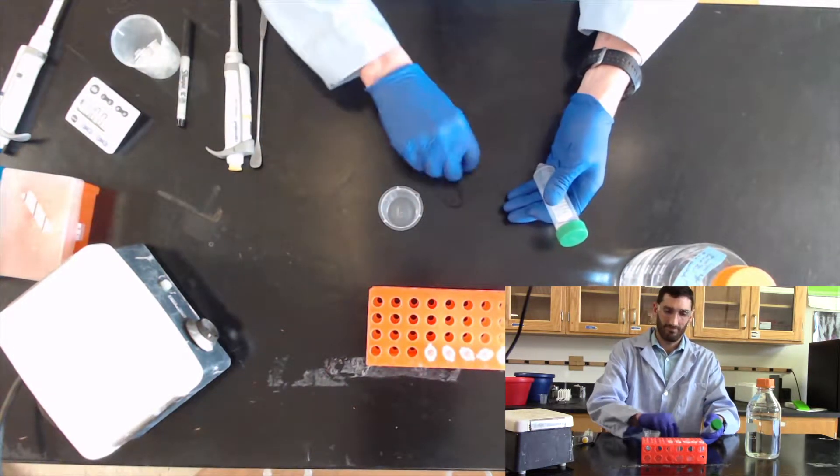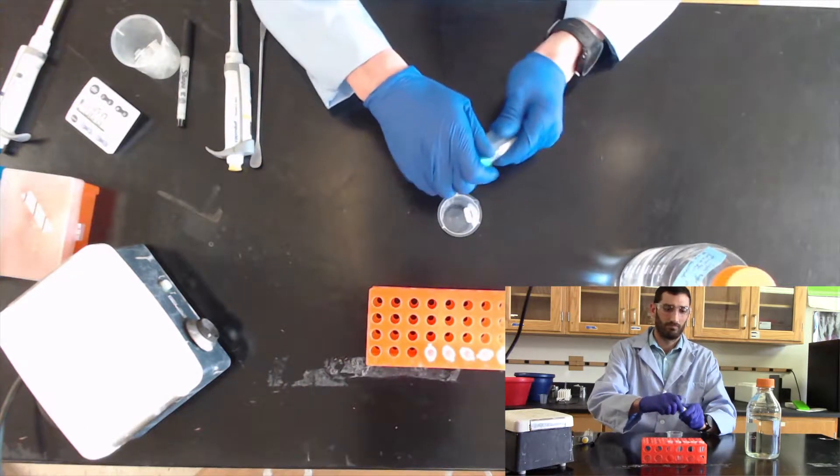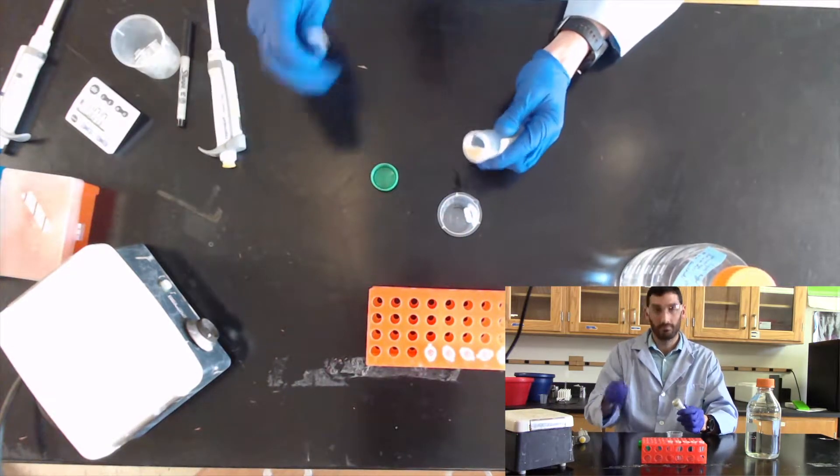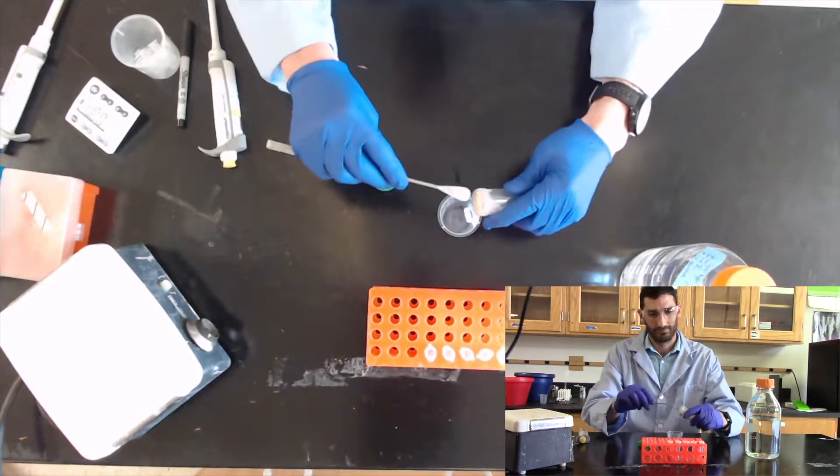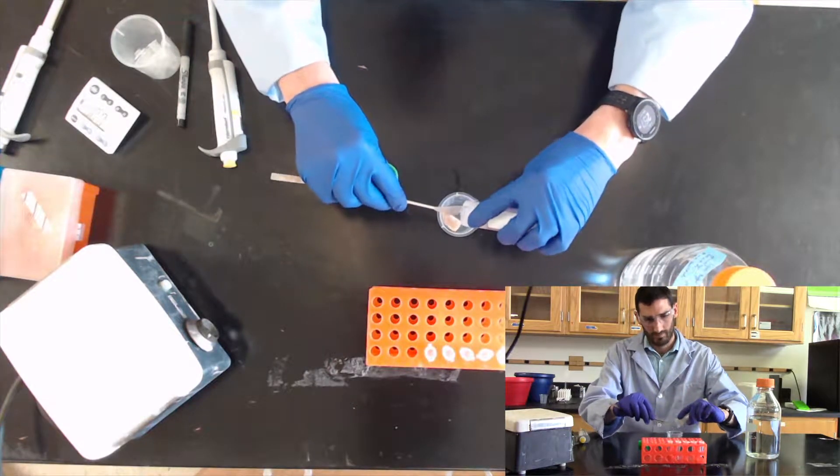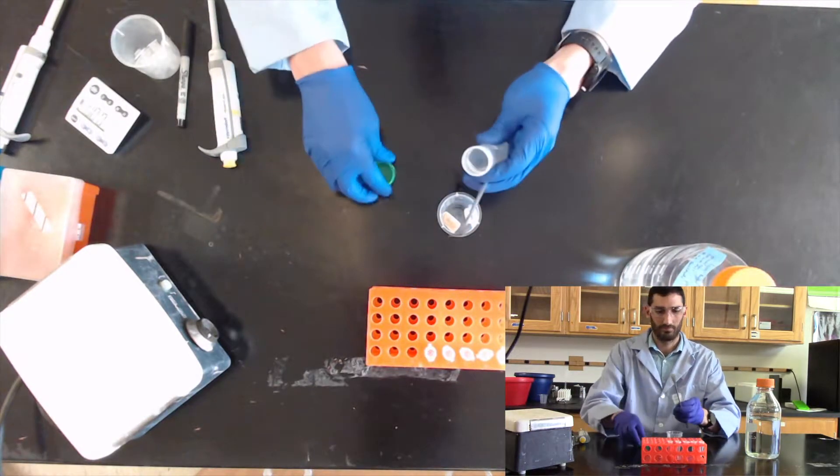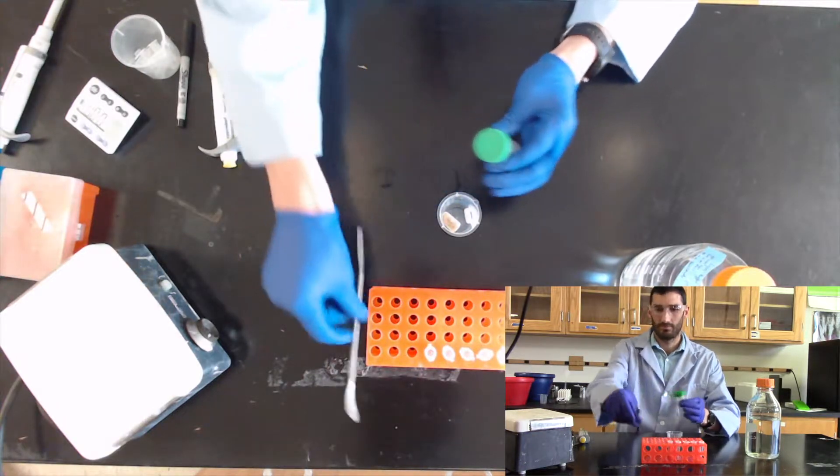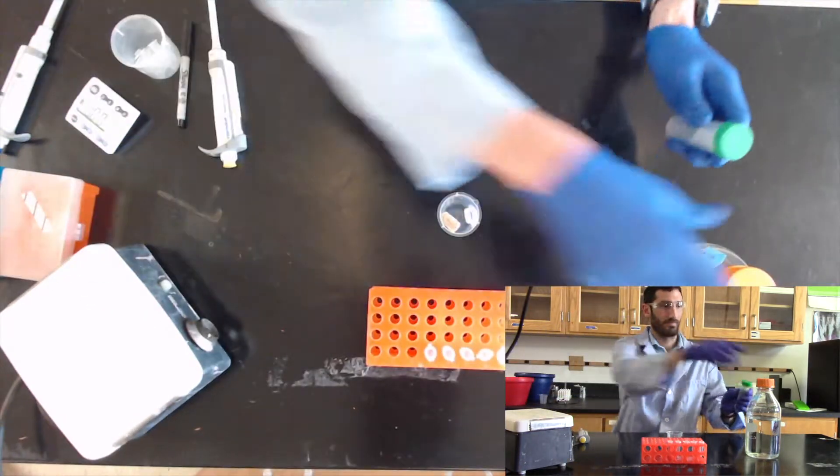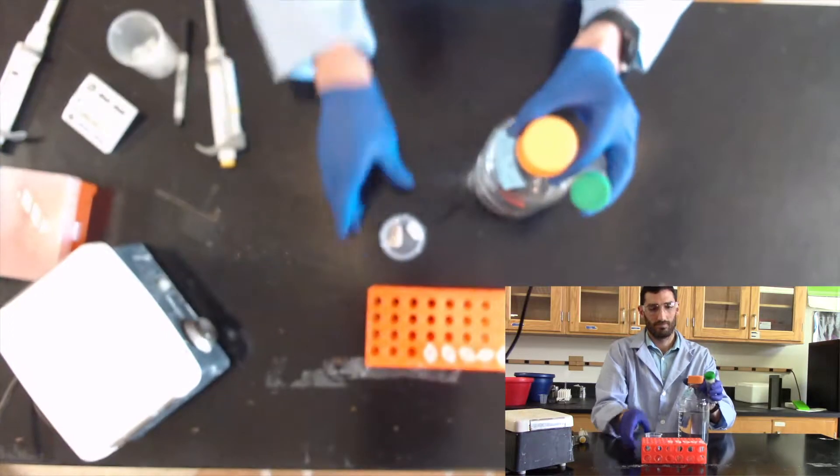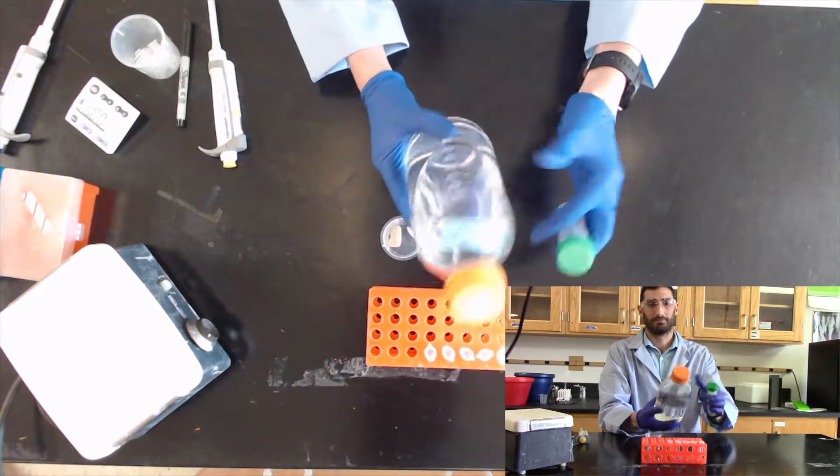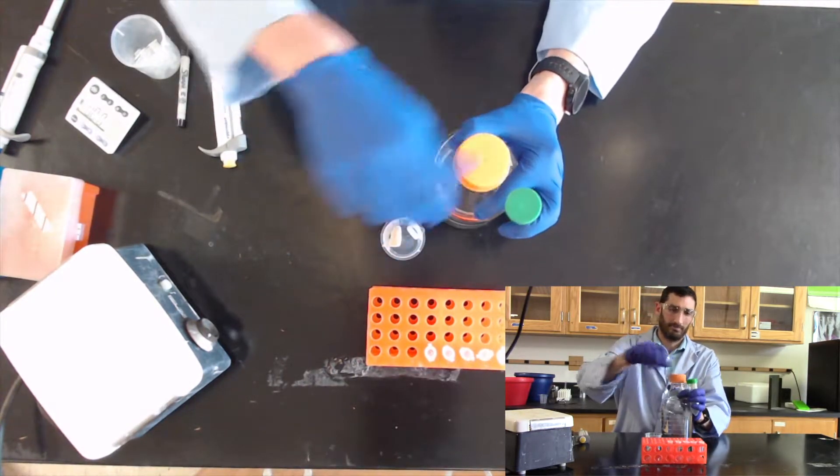To begin with, obtain your cell pellet. Transfer your thawed cell pellet to a beaker containing a stir bar. Measure out 5 to 10 times your cell weight in buffer A, which is your lysis buffer, and add it to your cell pellet.